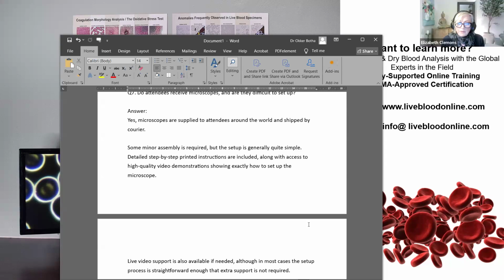Thank you. And have you updated the materials in the training course in the last 10 years? Yes, absolutely, we have. So we've added more protocols from practice. We've added a few more anomalies, and then we also have recently included anomalies related to vaccine injury as well. So the course materials are regularly updated when new information becomes available.